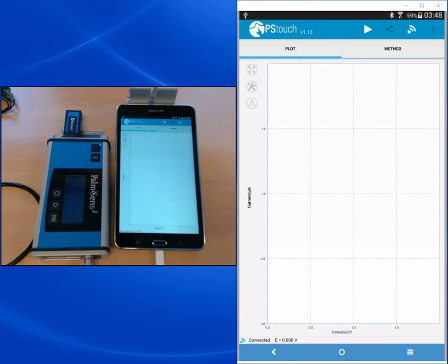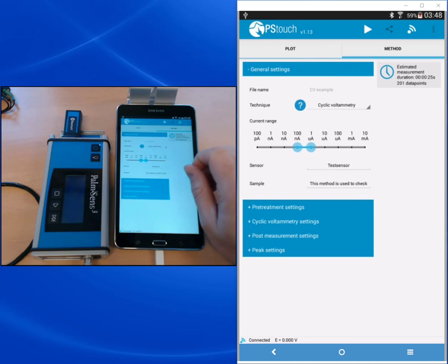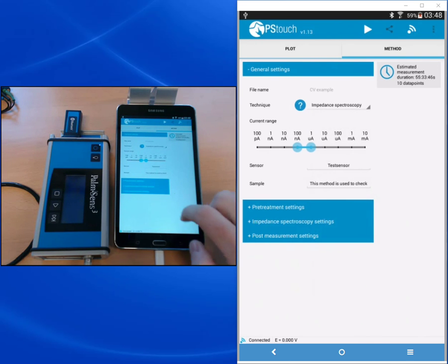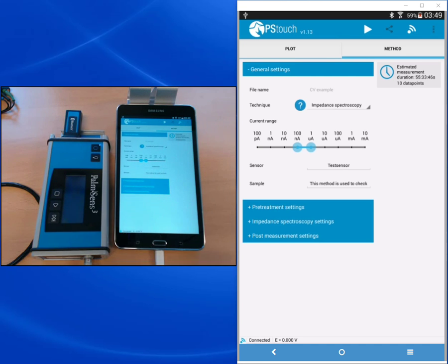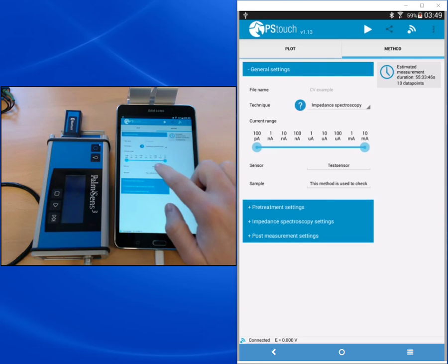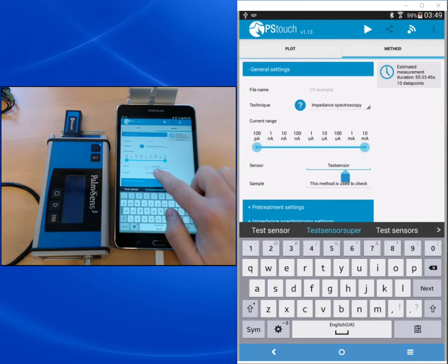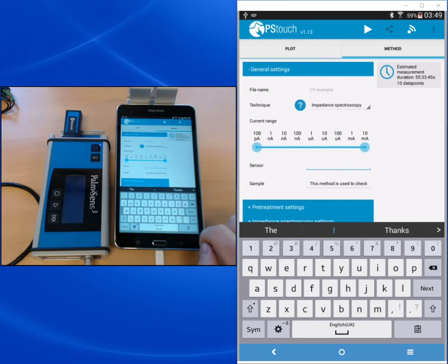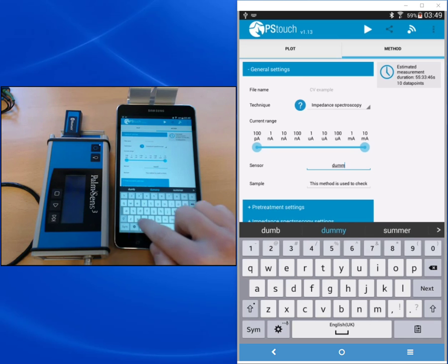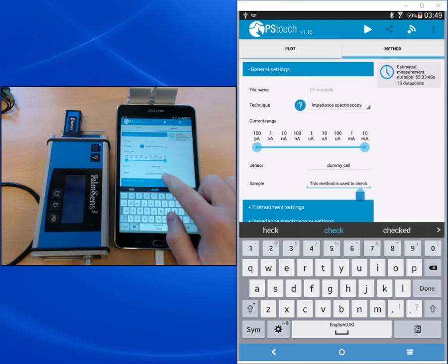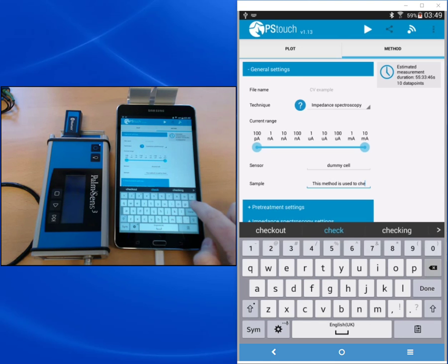So now we will look at the method editor to prepare our impedance measurement. We choose from the techniques list of course the impedance spectroscopy. For impedance spectroscopy you get high currents in the high frequency area and low currents in the low frequency area, so it is smart to choose a broad current range. So we just select all of them. As told before, our sensor is the dummy cell. You remember most likely that the fields sensor and sample are for your own notes. You can write in there whatever you like. We don't have a sample so I will just clean this field.